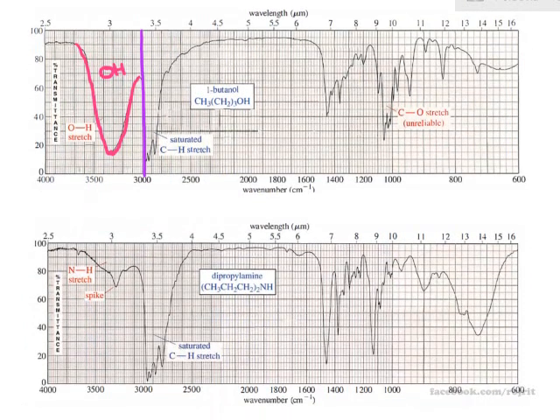Next, this is the amine. Comparing the amine with the alcohol, as you can see by these two spectra, the OH of the alcohol is very highly polar because of the difference between the electronegativity of oxygen, 3.44, and hydrogen, 2.20. For nitrogen, the electronegativity is less, about 3.06, which is very small compared with the oxygen atom. So it makes it slightly lower in polarity.